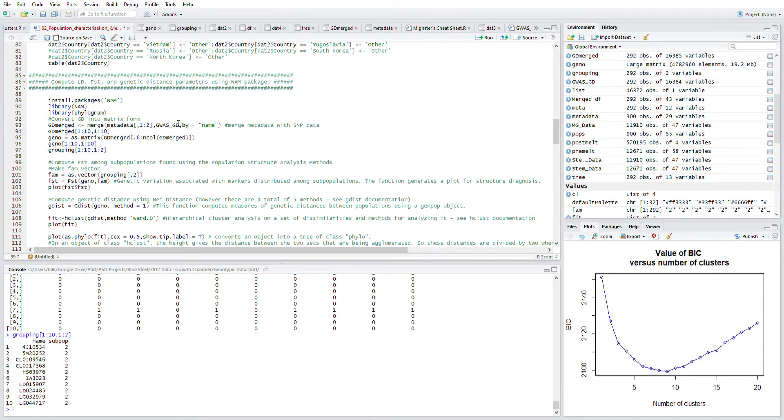We can look at the grouping data as well, which we did in the previous video, in which we have the name of the genotypes and their subpopulation or clusters that we've clustered them into.